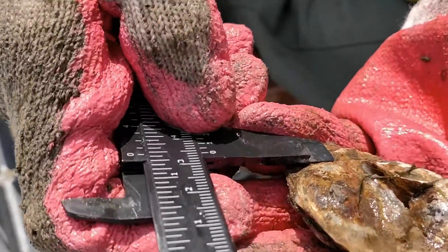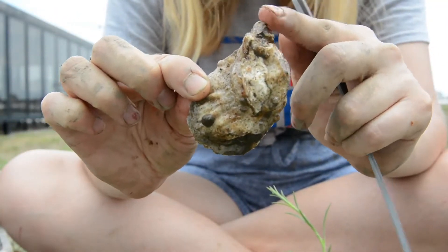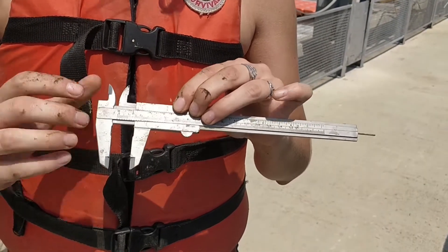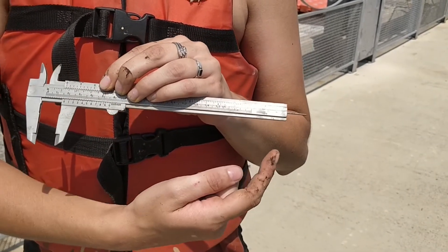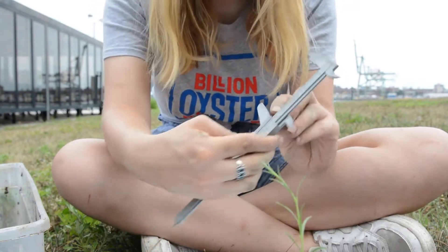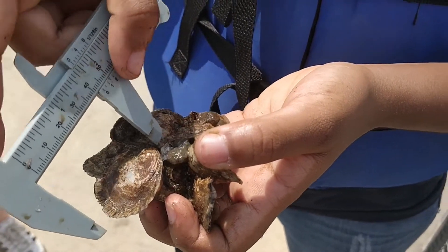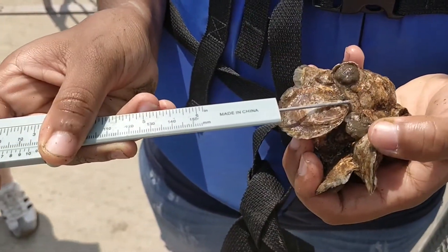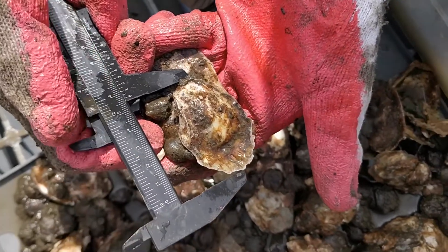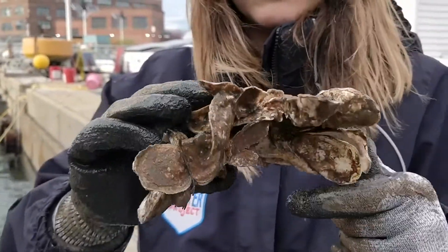You should measure the longest length of the oyster from the umbo or the hinge to the bill using a tool called a caliper. The caliper can measure a length between two pairs of teeth, but also with a needle end for hard-to-reach spots. Be sure to measure one oyster at a time using either the teeth or the needle end — either method yields the same measurement, so you can use your judgment. The needle makes it easier to measure densely packed oyster clusters. You then read the oyster's length on the metric side of the caliper located beside the teeth. Repeat this process for each oyster in the cluster.